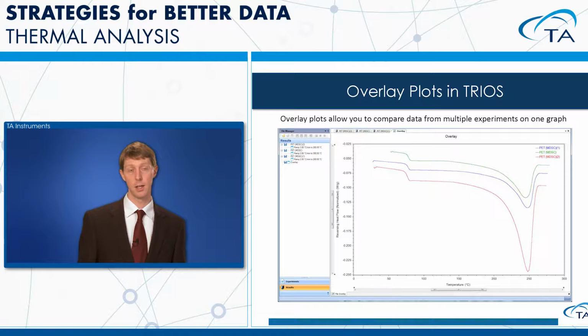Once you create it, you, again, have more functionality in terms of selecting particular variables. You can change variables. You can change your auto color, auto line style very easily in TRIOS. So there's a lot more power there than what we had in Universal Analysis.